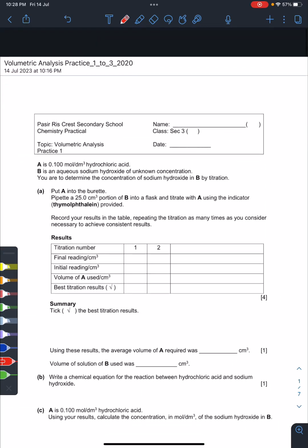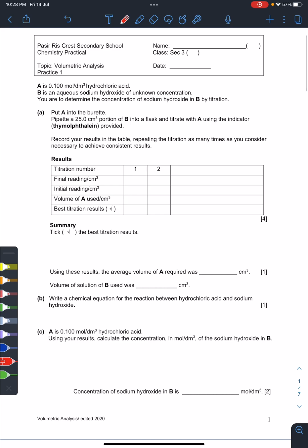So coming back, let's try the first experiment. I don't have the reading, honestly, but let's just work with a hypothetical value of 24. Let's say the reading is 0.00, 24.00, 0.00, 25.00, 1.05.